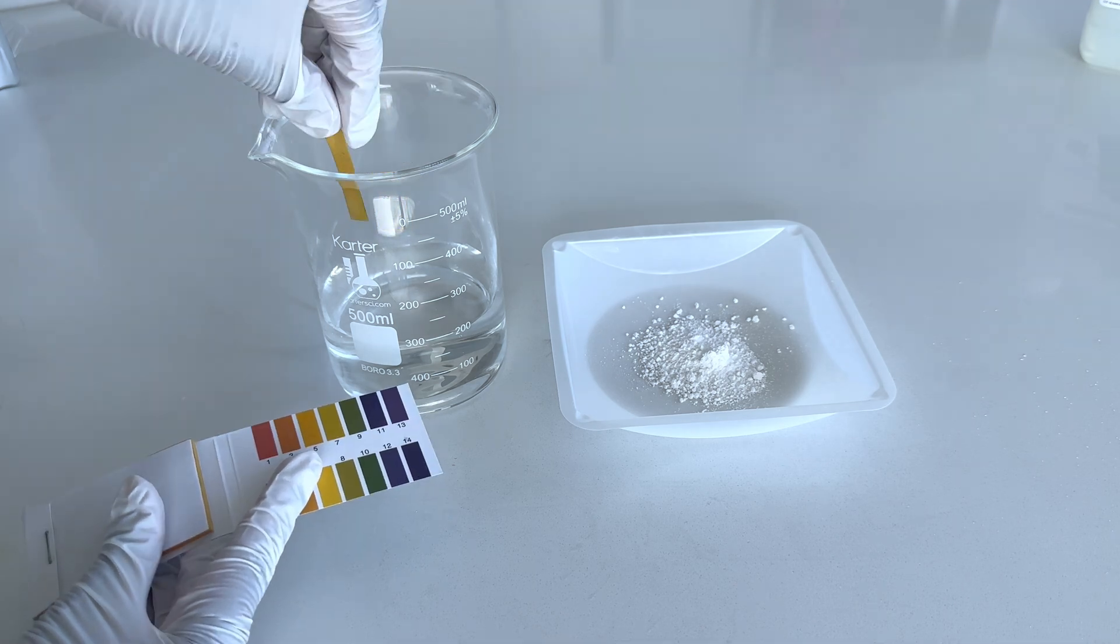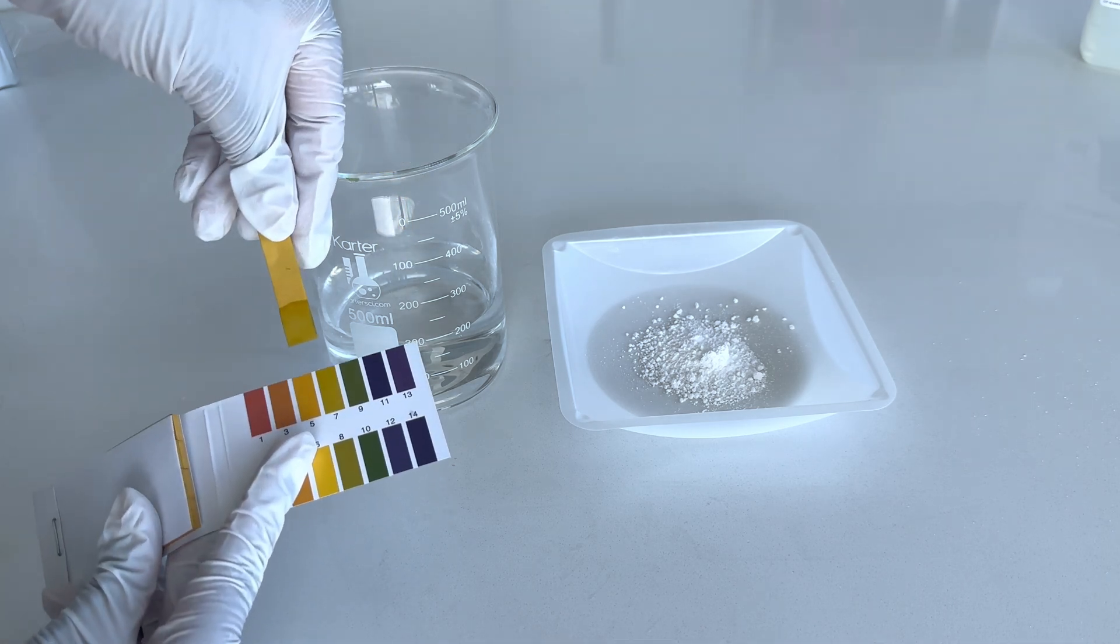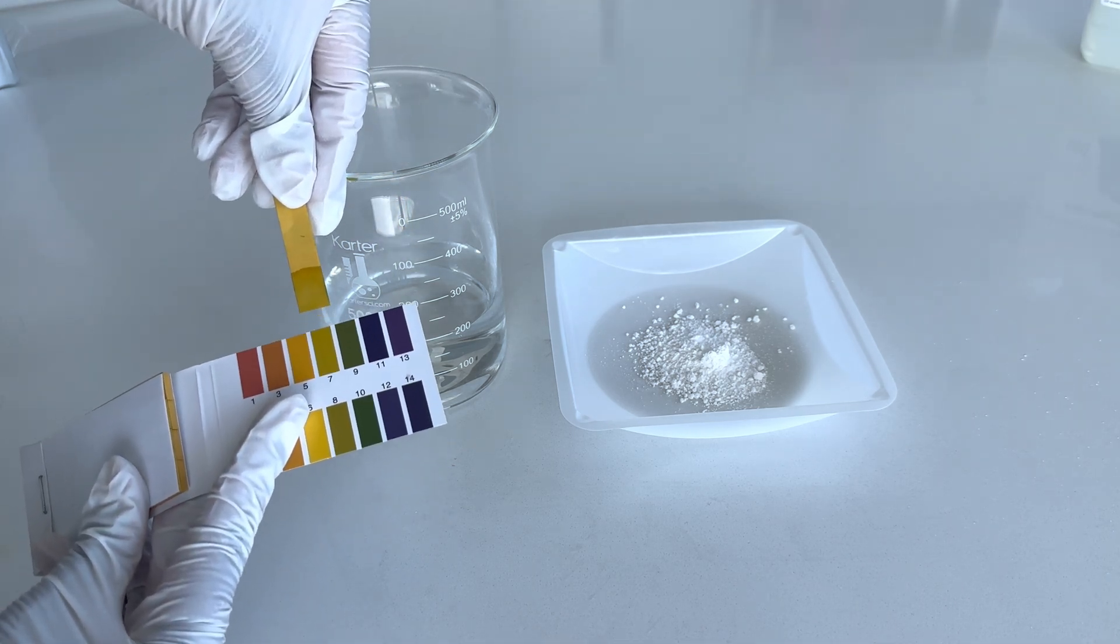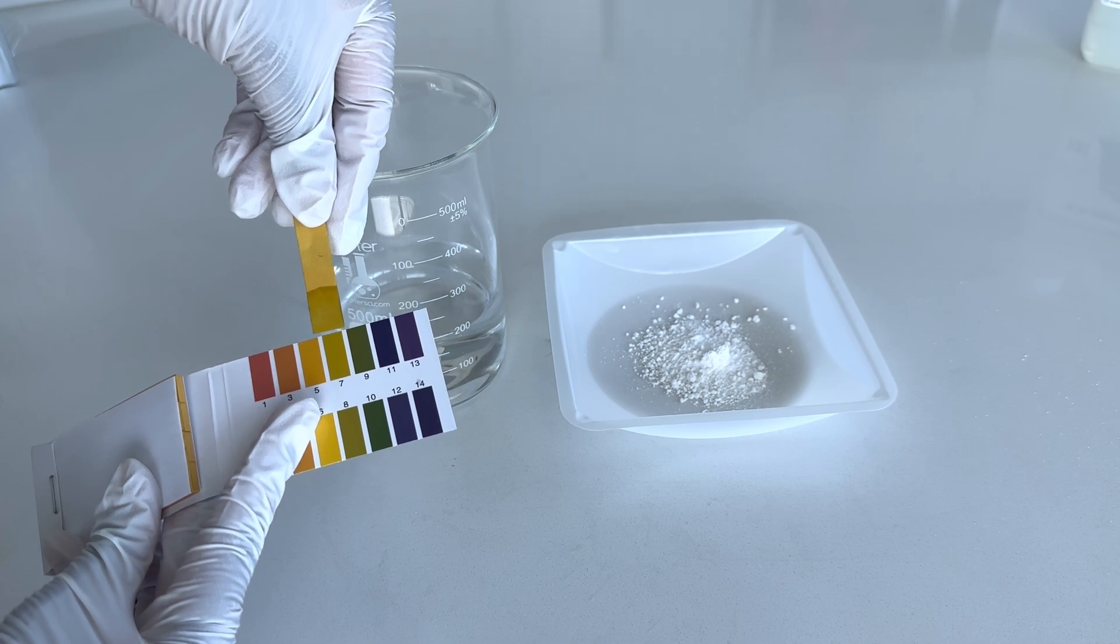I then check the pH of the water. As you will see later on, Carbomer will change the pH, but the pH of the water is 7, which is neutral as to be expected.